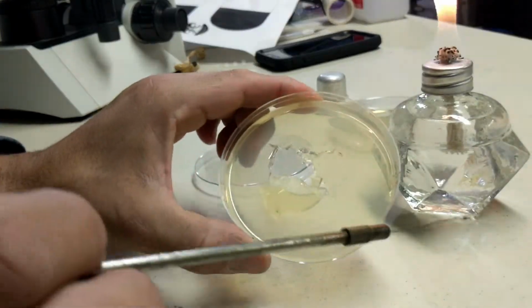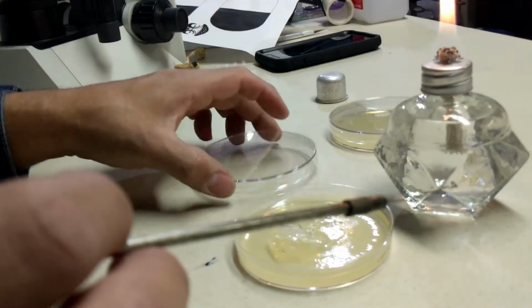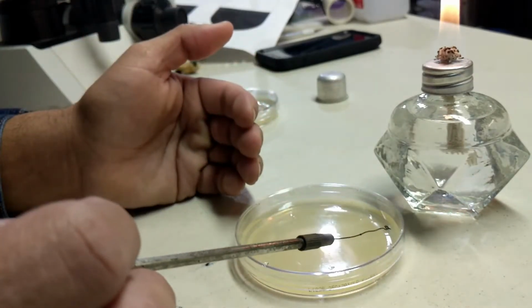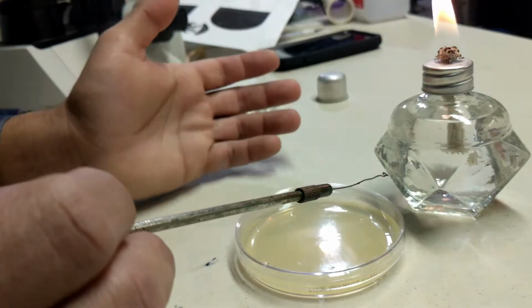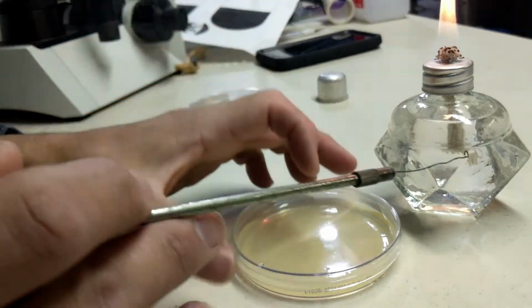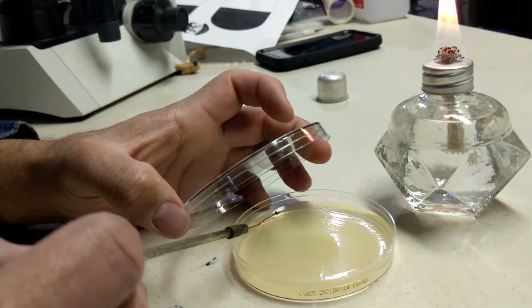So you can see marks in there, right? And then that would mark the surface of it. Why don't I want to do that in this one? Because I really want for you to see the streak plate of isolation using this plate. Because you can actually see the marks now, although you're not going to see the bacteria right now, but at least you can see the marks. So imagine that we still have the bacteria in there. So you come here and then you do your inoculation in the first quadrant.